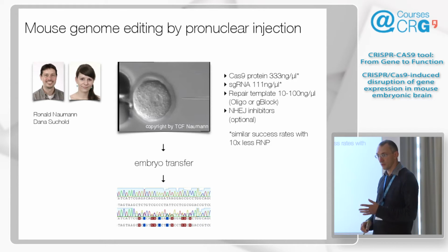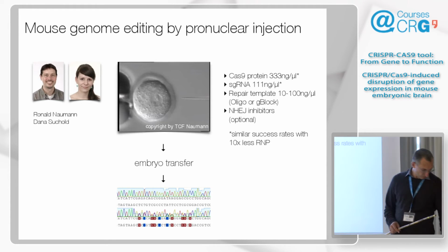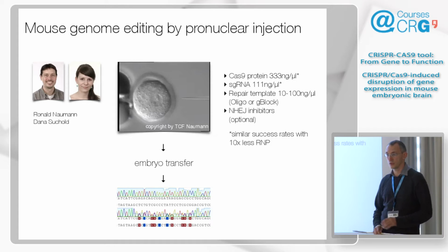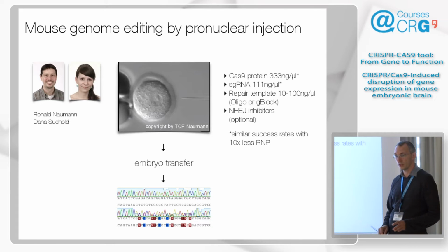So this is what we do a lot of. Pronuclear injections, I will mention a few things from it. This is our cocktail. I'm not certain this is optimal. We're still changing it, and it works with a wide variety of changes.